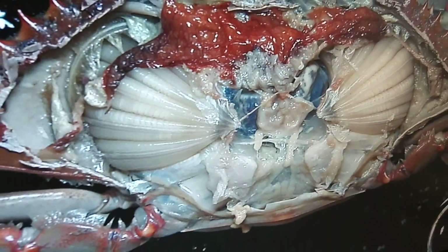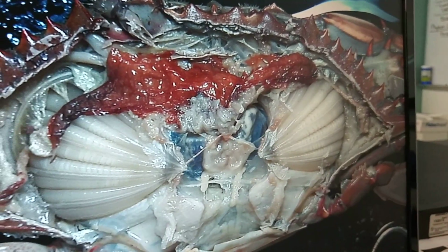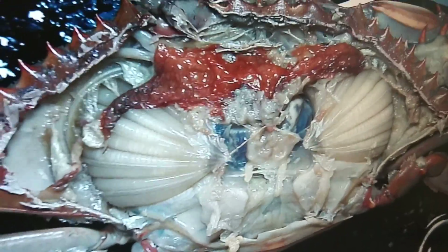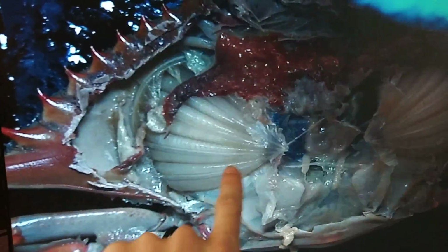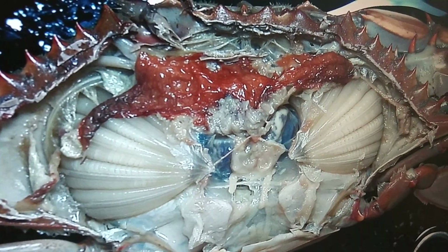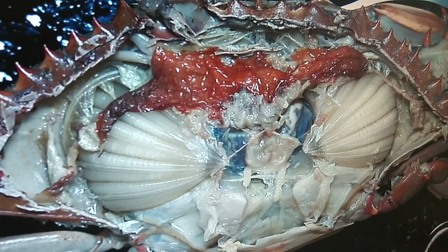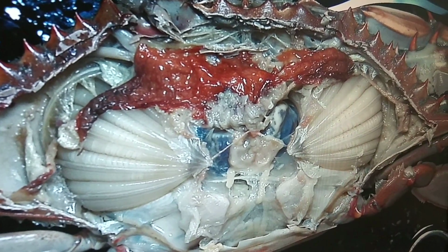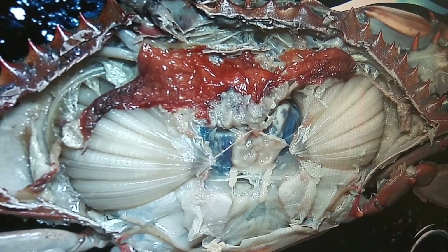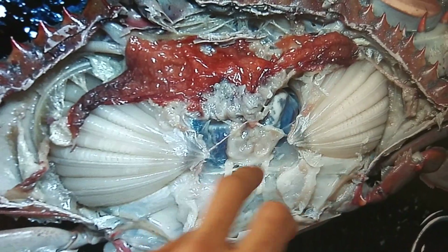The reason I said breathing is that the heart is going to be in between the respiratory structures. Think about where the mouth of this animal is, right here. The mouth leads to the esophagus, which leads to the stomach. So what's going to be more anterior to the heart? Your stomach, the cardiac stomach and the pylorus. If you look at your diagram, it goes mouth, stomach, then heart, and the gills point towards the heart. So give yourself landmarks: stomach to heart, and gills point towards the heart.